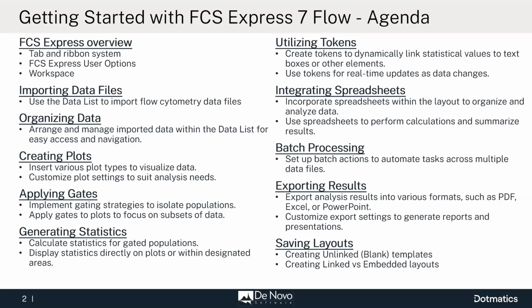And at the end, I'll show you how to save that layout as a blank template to use going forward, or how you can create linked or embedded layouts so that you can bring that data back up later to look at a later time point.